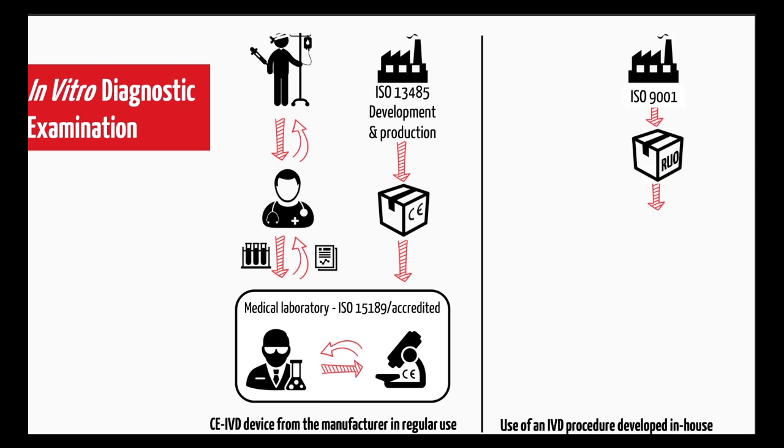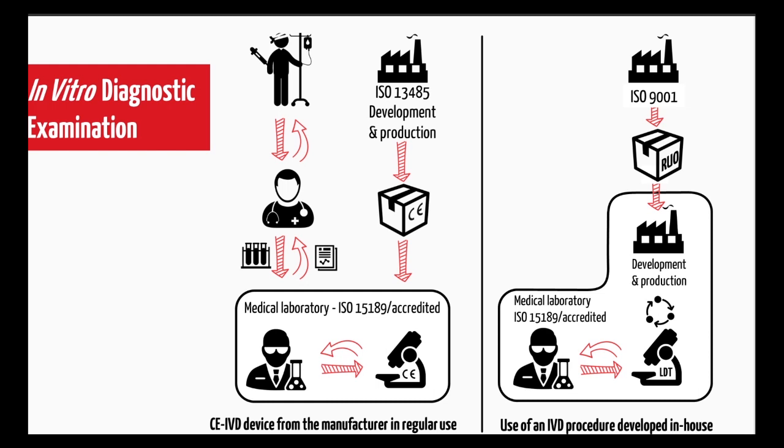And a similar scenario is where a research use only provider, a manufacturer of research use only products, delivers the product to the medical laboratory. And the medical laboratory takes over some of the development and production steps to have those products ready for use in their validated laboratory procedures.